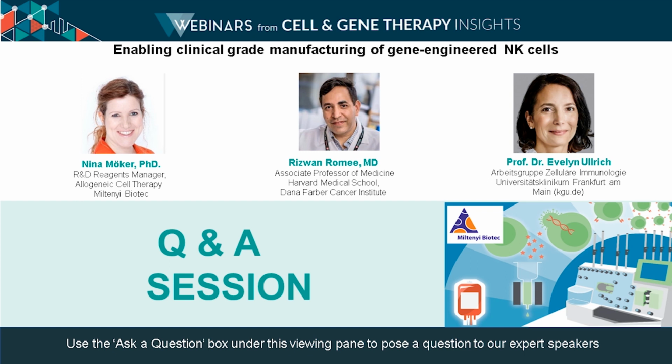Yes, thank you. By developing the CAR T cell therapies, which Miltenyi has done, but also a lot of other companies and academia, I think many others have learned that establishing the analytics of a gene-engineered cell product is at least as much effort as establishing the manufacturing process itself.